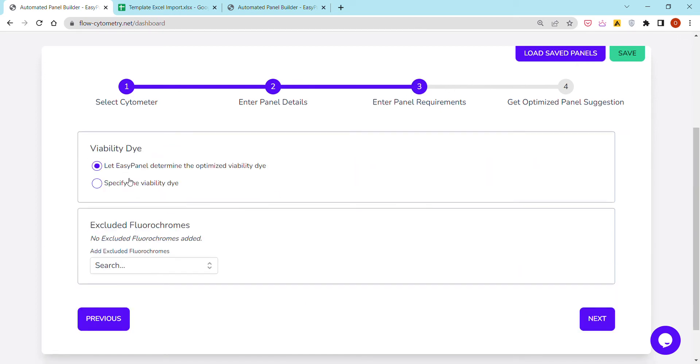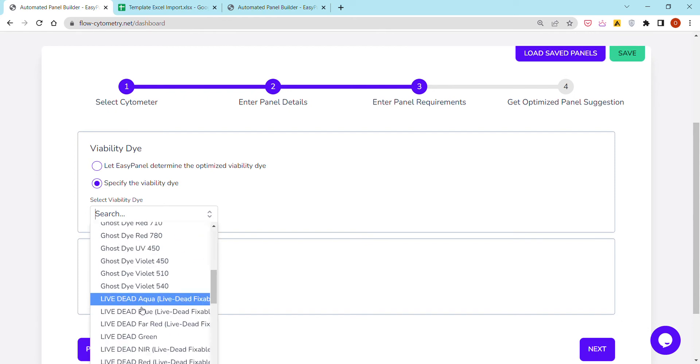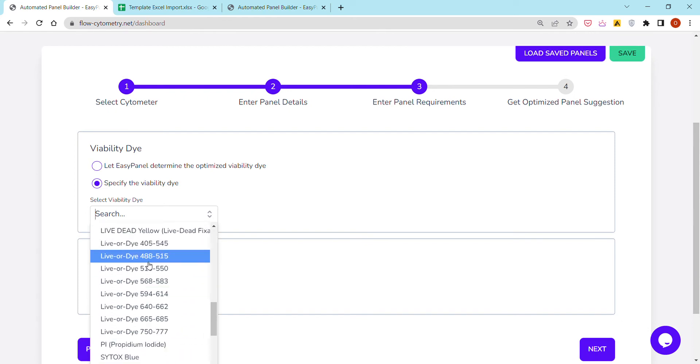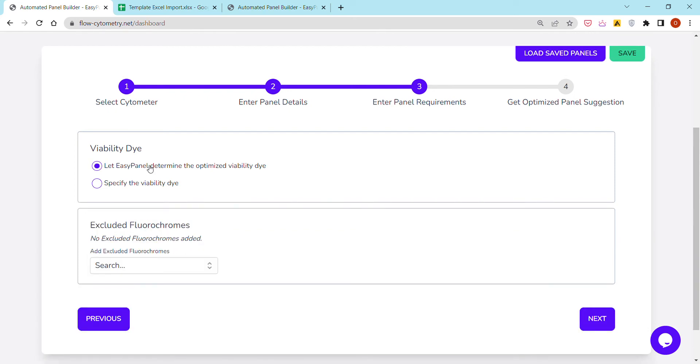Same thing for the viability dye. You can specify within a pretty large database of viability dyes, or you can just leave it unspecified and let the platform design it for you. There is another nice feature here, which is excluding fluorochromes.